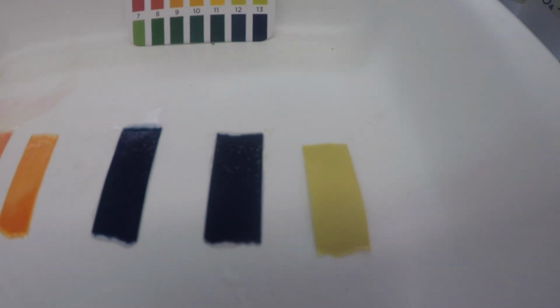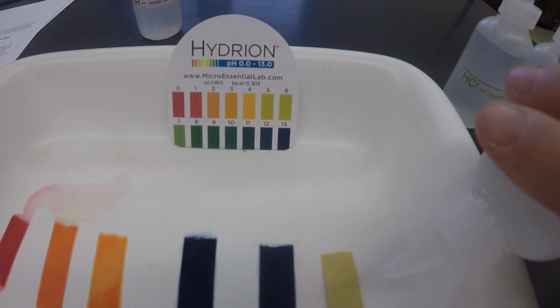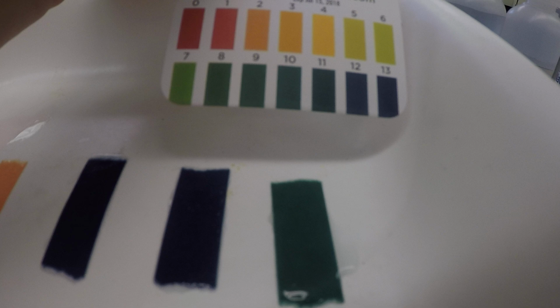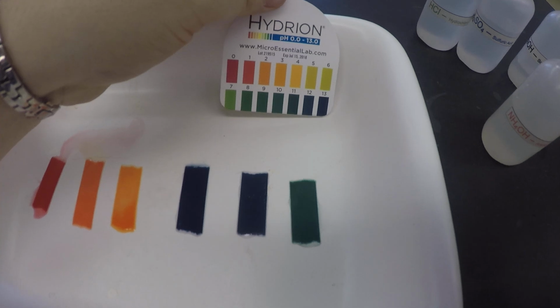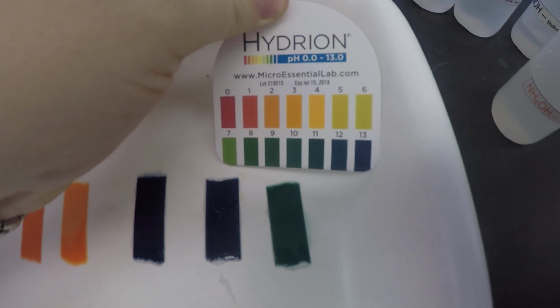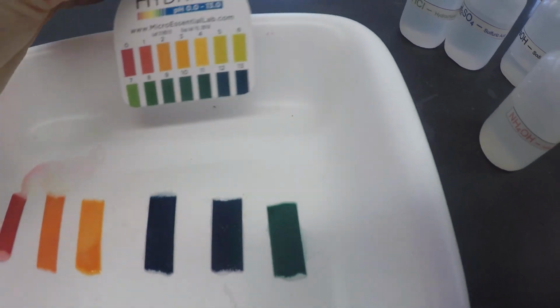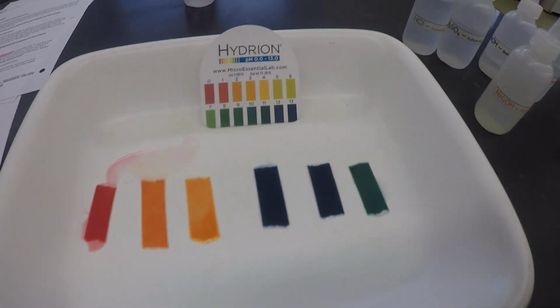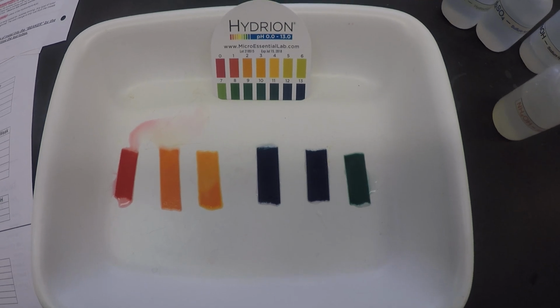Our final one is ammonia hydroxide. You can see that this is obviously not a blue this time. It's more of a green. Which green do you feel that it is? Very good. So that's the first part. You can see the differences between those.